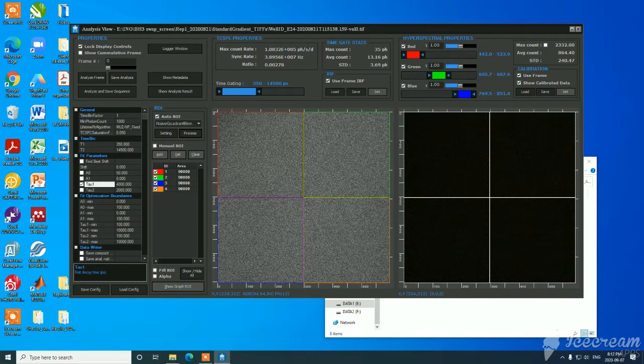Here you see none, but the analysis will extract the lifetime, the counts for each square, and then we will divide by the area of that square and get the intensity per pixel. If there is an aggregate that appears in one of these squares, then we will obviously identify that as an outlier in our standard curves. So that's why we do 4 squares in this ROI selection.